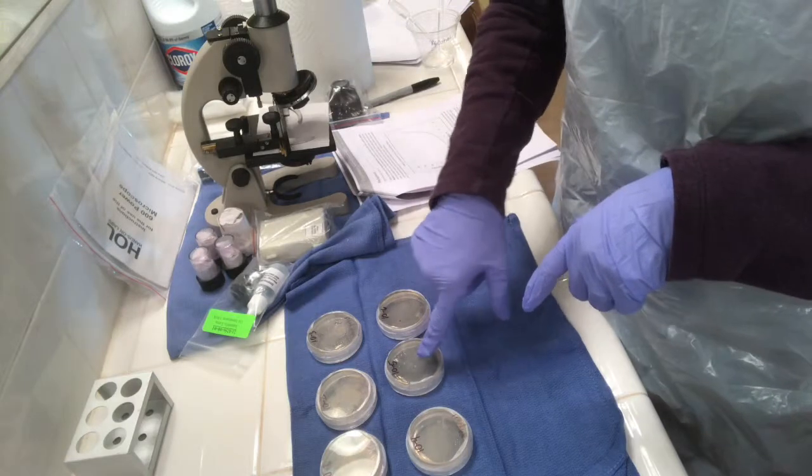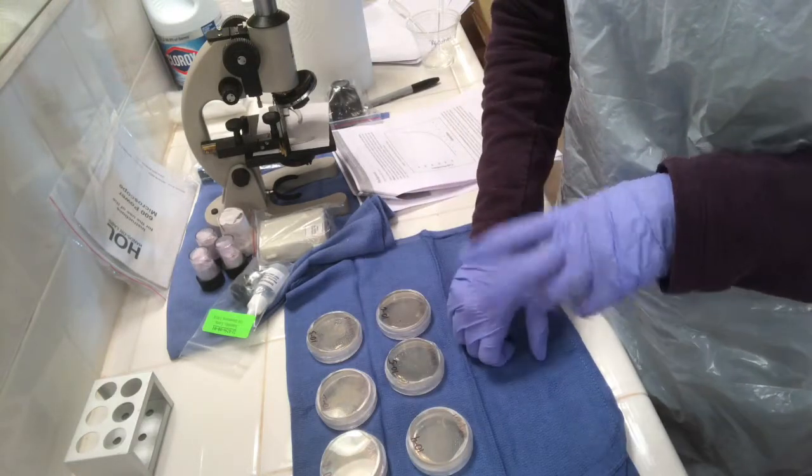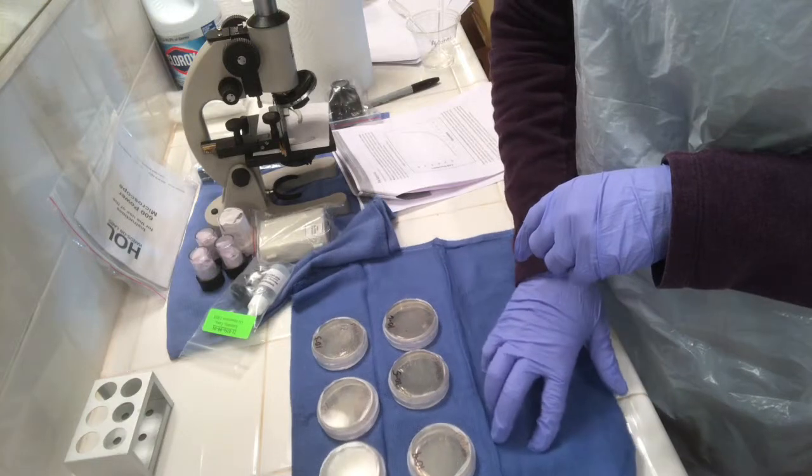So 10 to the 5 was the one that I used to do the calculations to find out how many microbes were in the parent solution. And that is in our lab.